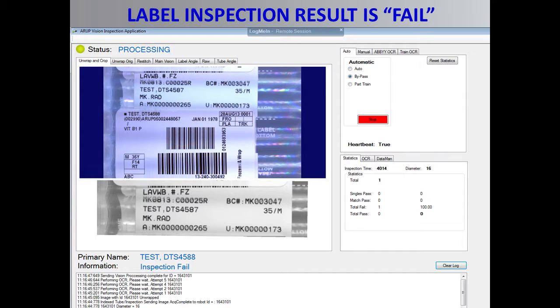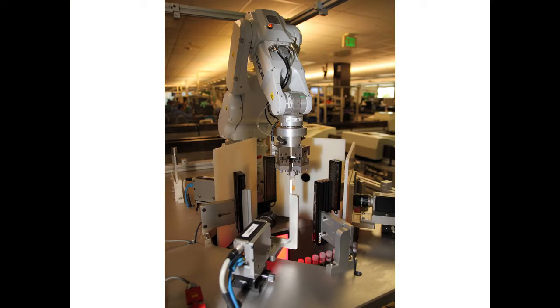The OCR system can also rotate the image by 180 degrees when the labels are oriented in that direction.